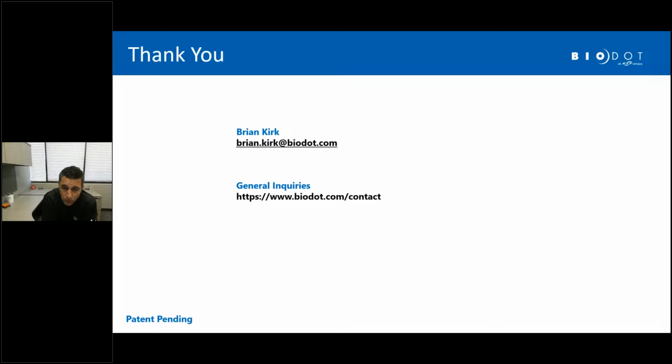You want them not to change over time, because if you think about the process, we're scanning over these partitions at high speed, and if there was great variability with respect to the partition, then we can't rely on the position of that partition or the size of that partition, and so that could affect throughput. You may have to do what we call step and repeat as opposed to on the fly, so you could have issues. So high quality, either stainless steel or aluminum.